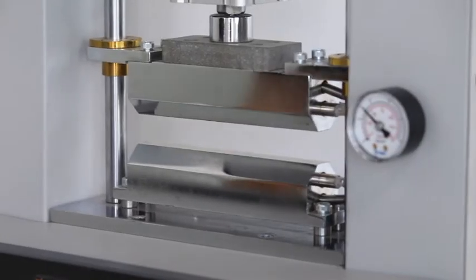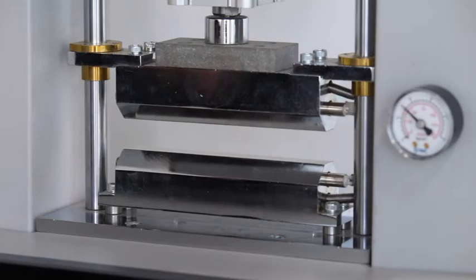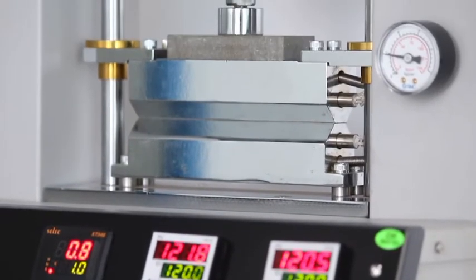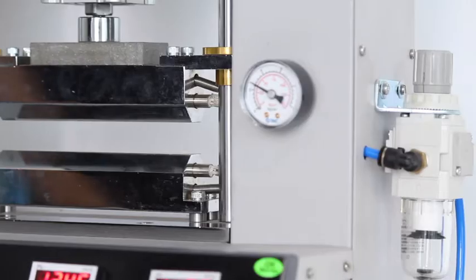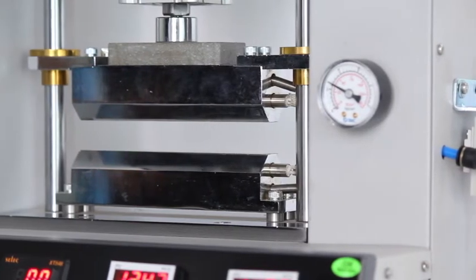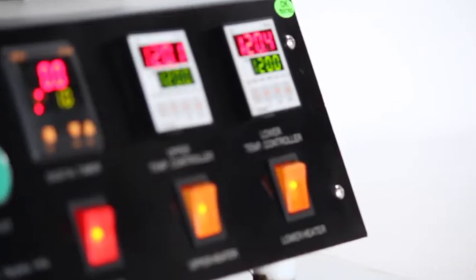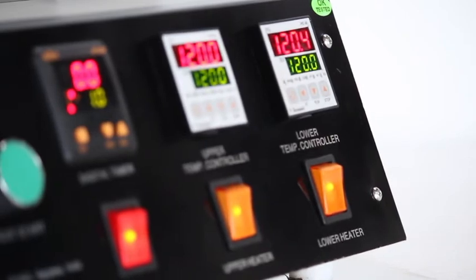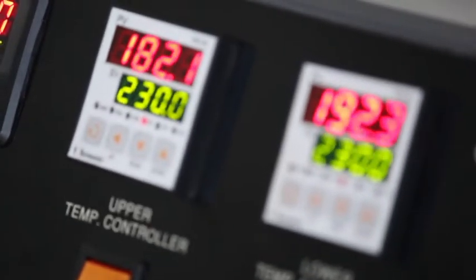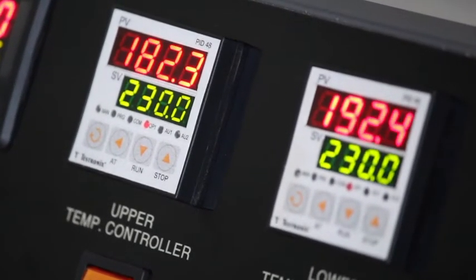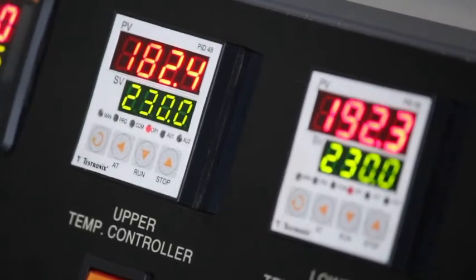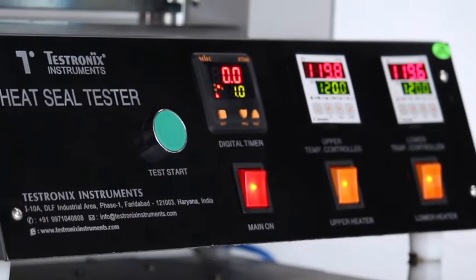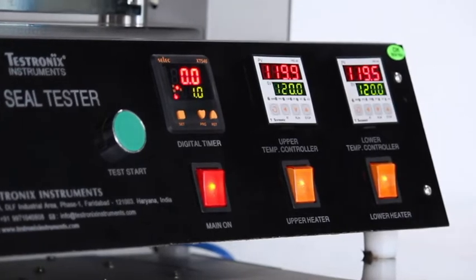The instrument consists of independent temperature control systems for both the jaws and the aluminum encapsulated heating tubes, ensuring even temperature along the sealing jaws. The heat control unit employs auto-tuning and adaptive digital PID temperature control technology, and provides research institutions and flexible film manufacturers with reliable technical assurance.